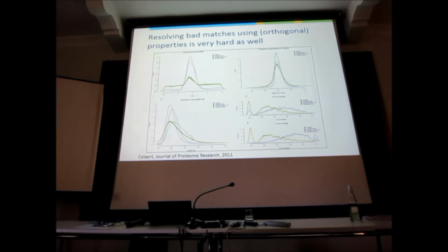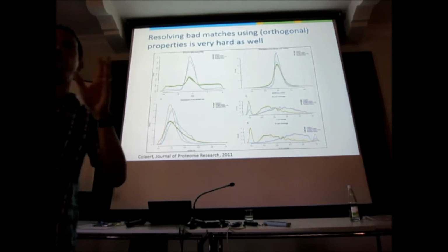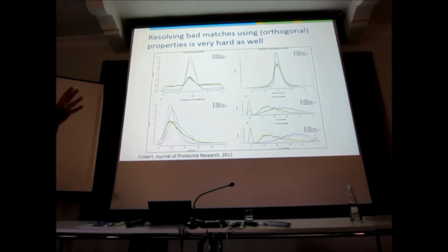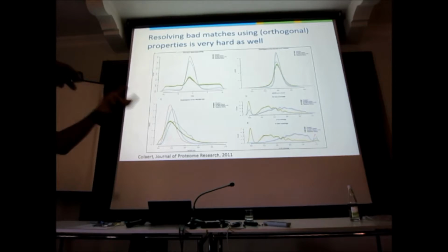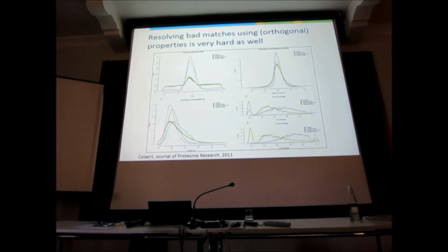So you can look at the mass difference of each of the fragment ions. You can look at the ion intensity and the B ions and the Y ions. You can look at how many B ions, how many Y ions. And if you look at all of these things, maybe you will find a pattern. For instance, decoys tend to have fewer Y ions, but more B ions than target hits. And so it learns, it adapts to that, and it figures out how things are different. So we try to find whether there's a way that we could use this approach to differentiate between the different hits.